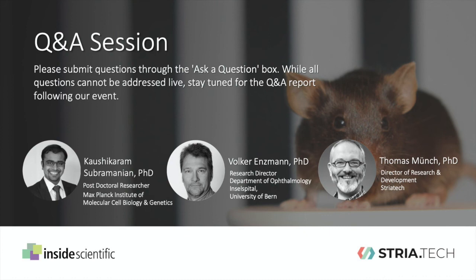Okay. Volker, we're going back to you for this one. What are the advantages, what are the disadvantages of manual versus automatic OMR measurements?